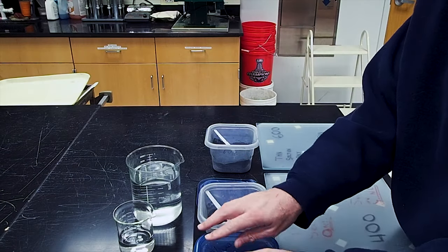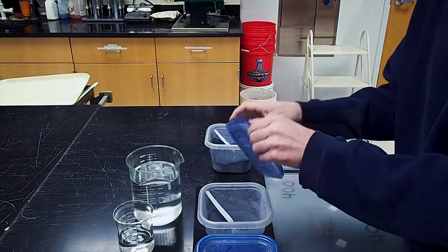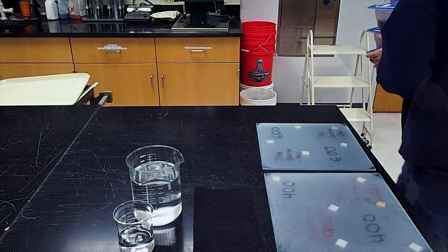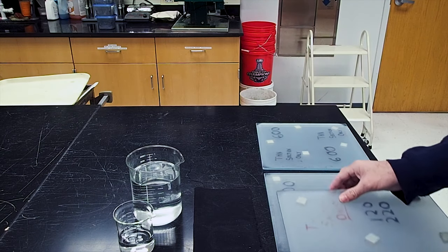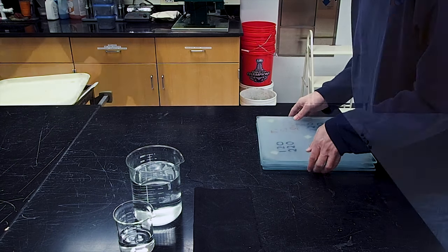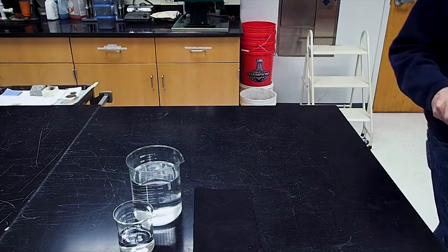When starting off with a freshly cut rock chip that needs to be polished for epoxying to a slide, you will want to start off with a coarse grit size of 60-90 to even out any rough surfaces or saw blade marks, and work your way up through the finer grit sizes until the surface is well polished.